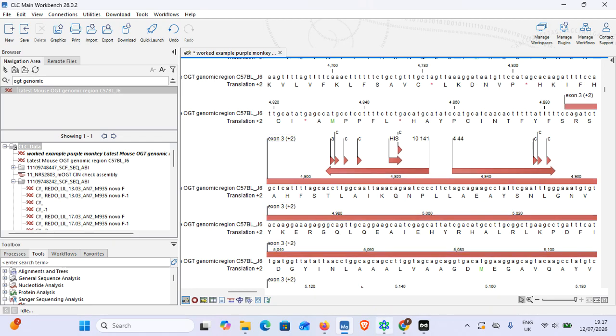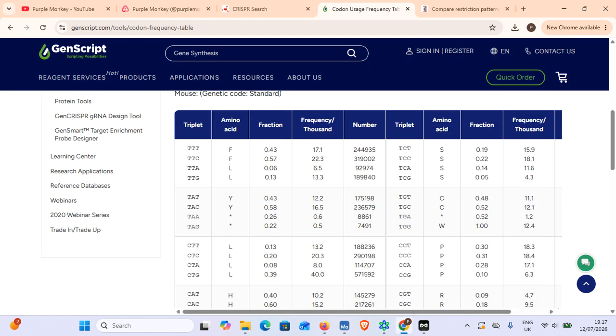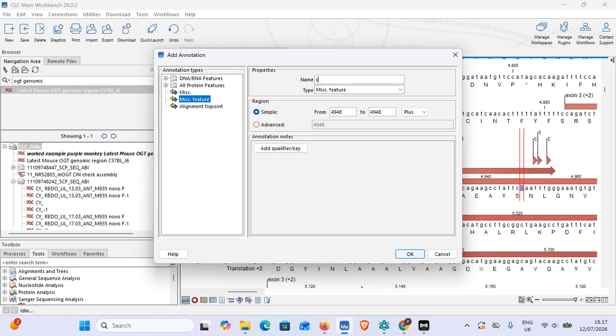TCG. What change can we introduce here? TCG will be upwards. TCG. And it's an unpopular one too. Oh, well, just to be different and to avoid doing yet another C, I'm going to make this TCT. So there. Okay? I'm not unimaginative. TCT. Say it with me. TCT. So, add that annotation. No more C's for you. Here, have a T. Nice spot of T.